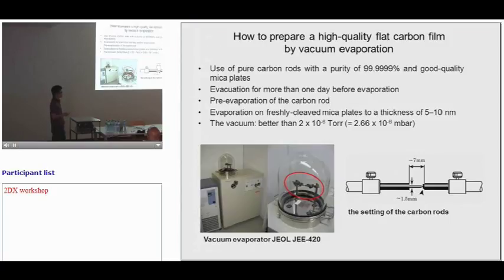I'd like to stress here that it's very important to evaporate carbon without any spark from the rods. So in order to achieve this, we evacuated the jar for more than 1 day before evaporation. Pre-evaporation technique is also needed.